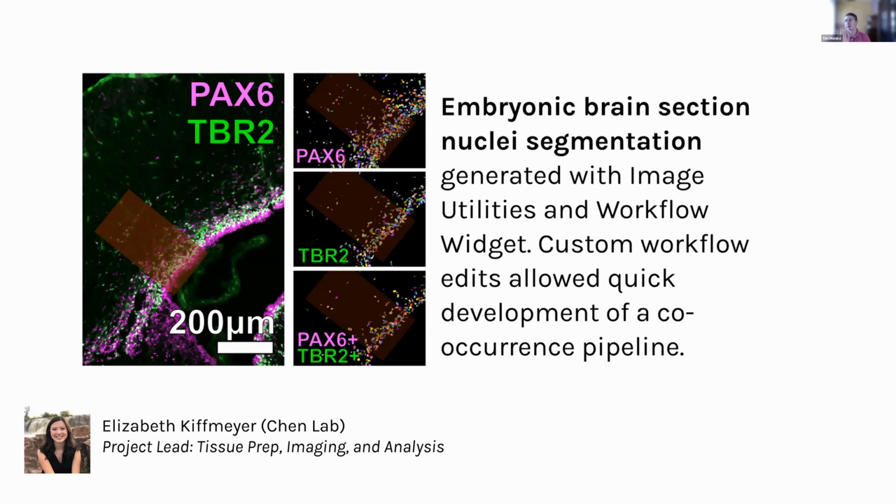I was doing this exact same analysis in ImageJ, and I've designed it entirely differently in Napari, and I think that it has a lot more strengths than what I was using previously. In particular, because of that live feedback of building a workflow, the way that you manage ROIs in Napari, I think, has progress that can be made. It does not work like you might be familiar with ImageJ, but that progress is going well.